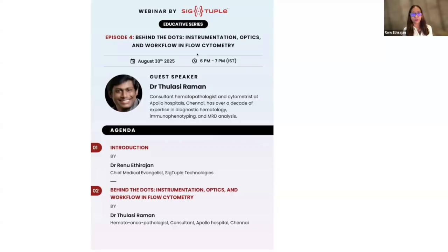So let's strip the jargon and get into the workflow of flow cytometry, the instrumentation and optics. We all know that flow cytometry is a very powerful tool in hematology, and over the past few decades, it has transformed to become a cornerstone in hematology, oncology, and clinical diagnostics.